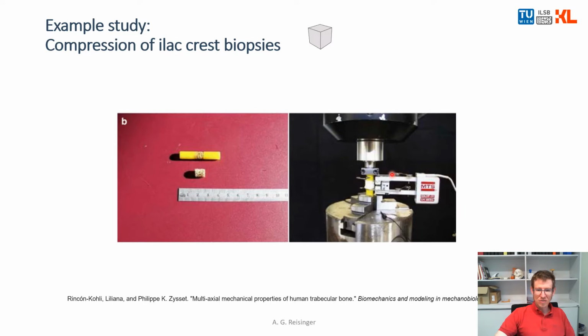This is an extensometer. An extensometer has two bridges or two beams, and they can move. So these are two beams, and they are attached to the sample. And when the sample is compressed, the two beams go like this, and this can be measured really precisely with a resolution of 1 micron, for example, 1/1000th of a millimeter.